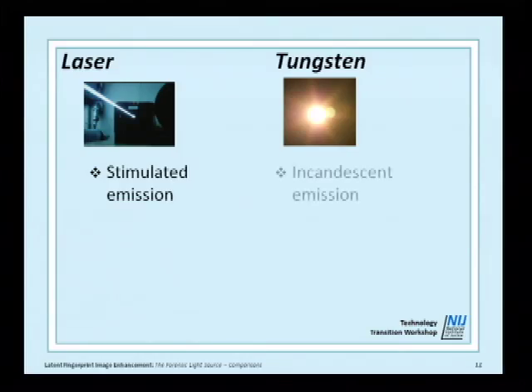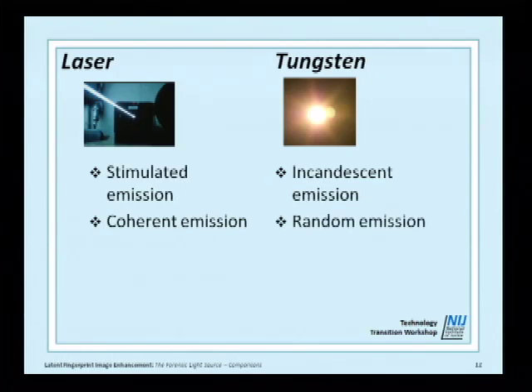You have stimulated emission with the laser. You have incandescent emission on the other side. You have coherent emission versus incoherent or random emission, out of phase. You have straight line emission with the laser, and you have point source with the white light source.